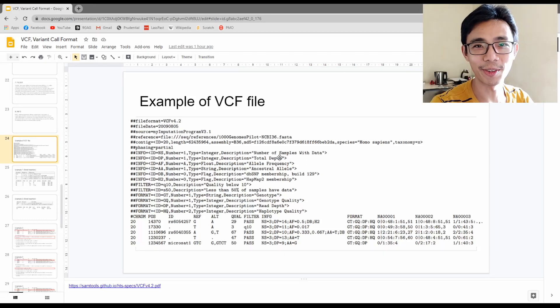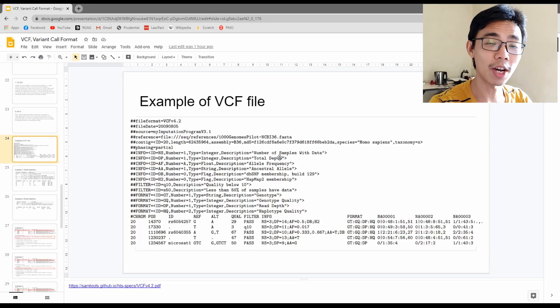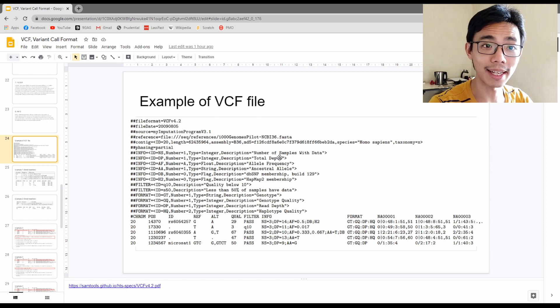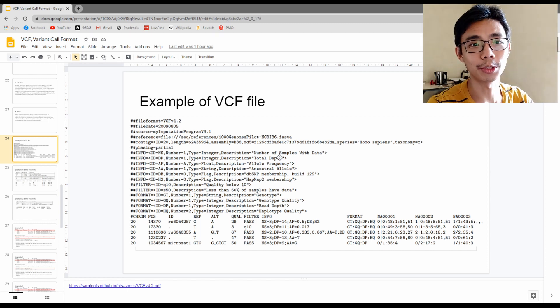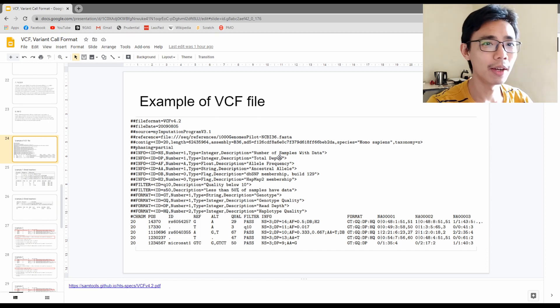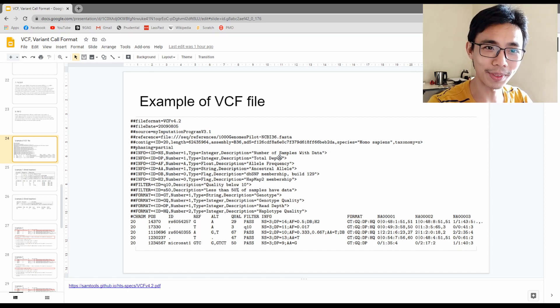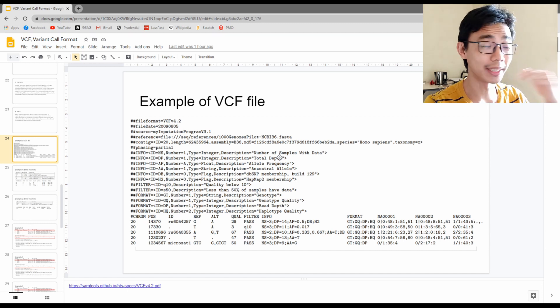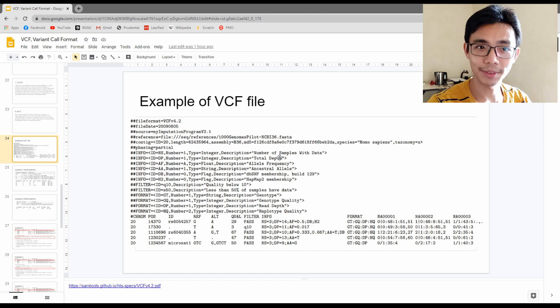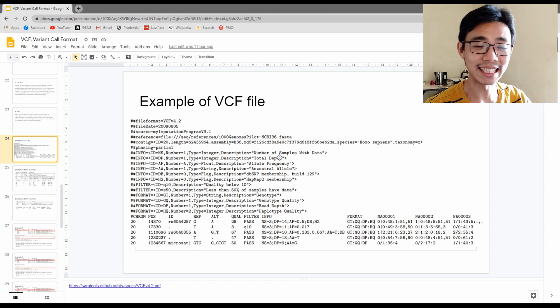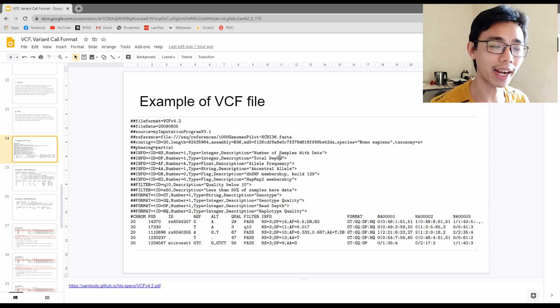Hello, good afternoon everyone. Welcome to the last part of the VCF format tutorials and walkthrough of what VCF is about, what is variant calling. Today we're going to go through a few examples using a sample VCF file to check if the understanding we have previously is actually correct.